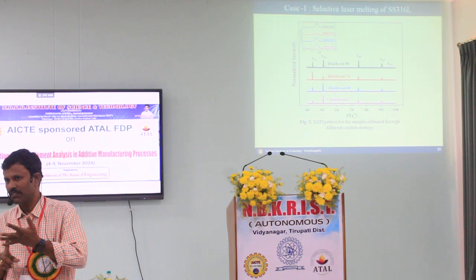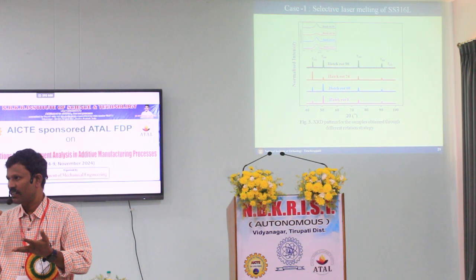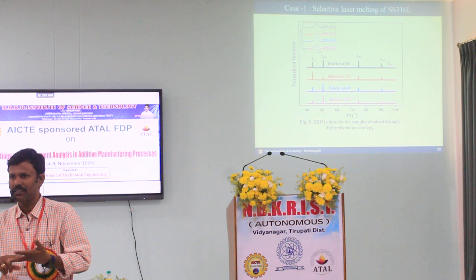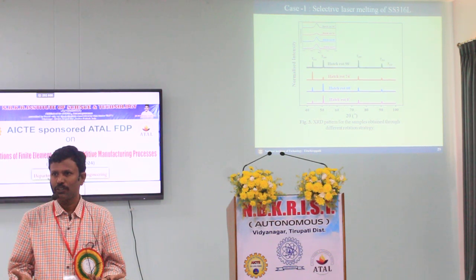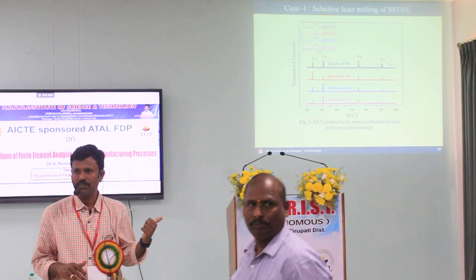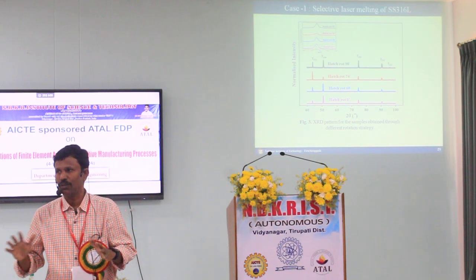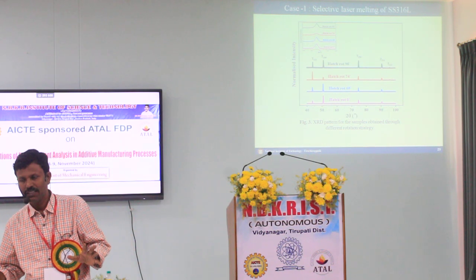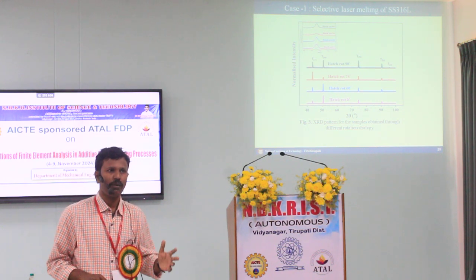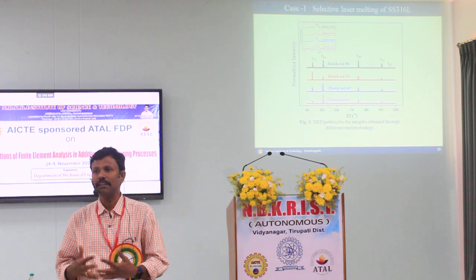First, visual inspection. First of all, we should check whether the component outcome is good, that is the primary thing. Once you are satisfied with your eye that the component appears to be good, we will go to optical microstructures. There we will see that the finer porosity and grain boundary distribution and other things are quite good. Then we will go to phase analysis, XRD. Normally this is the process we can adopt. XRD will give us phases.